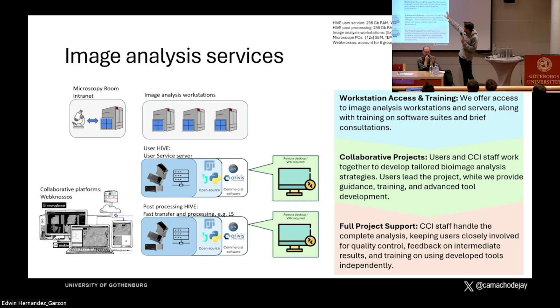So we will expect you to know how to do certain post-processing steps. For us, the computers at the microscope room are very important, and of those we have 12 machines taking care of these steps. Then that can be transferred to image analysis workstations. Of those we have about 5, if I counted correctly, and they will handle a broad range of services already. But in this case, we have trained the users to do this. We are not providing the image analysis service ourselves. We are just training them and giving advice.